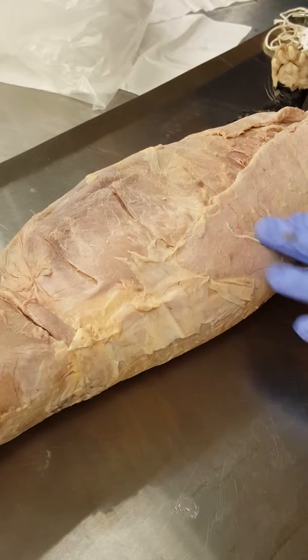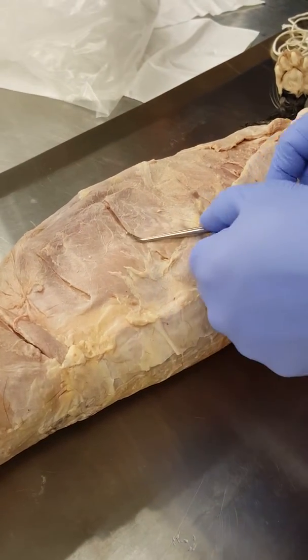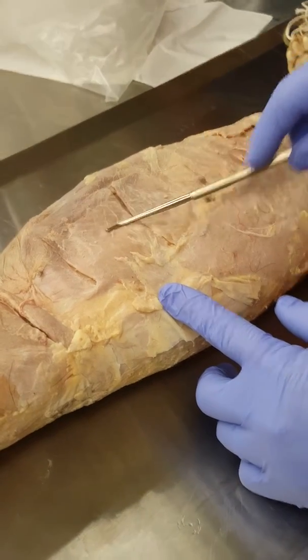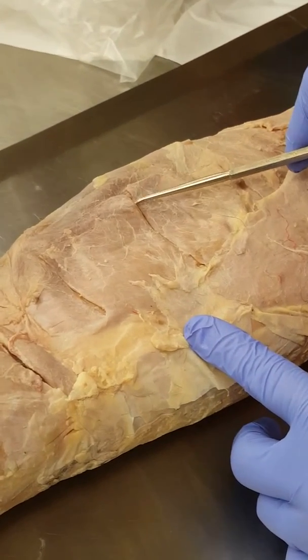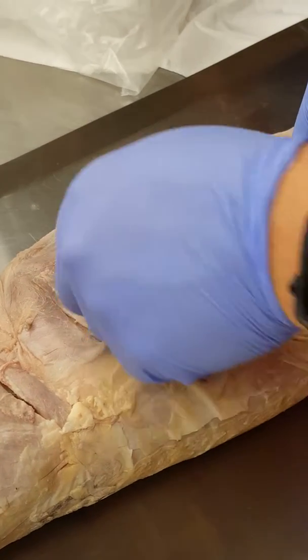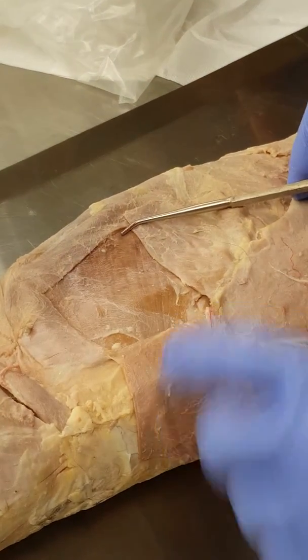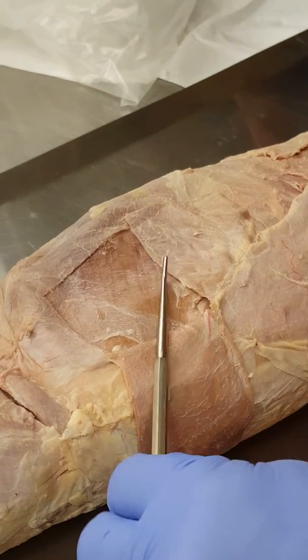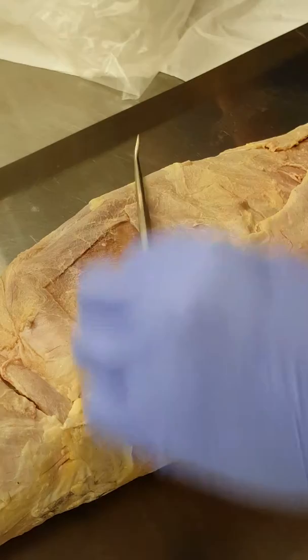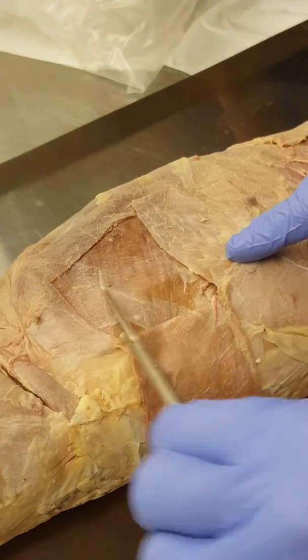The different layers, so you can see the fibers coming down like this. So this is external abdominal oblique, right? Fibers going down like this, and then when you peel that back, you can see the internal abdominal oblique, and the fibers are going the opposite direction. Okay, so external goes this way, internal goes this way, and you can actually see that. You can see the fibers.